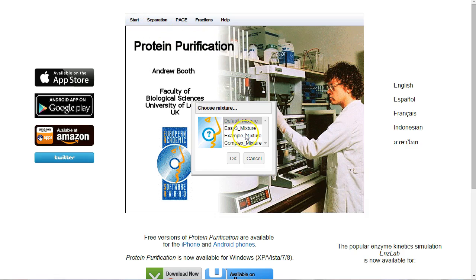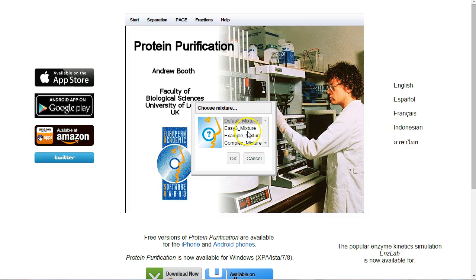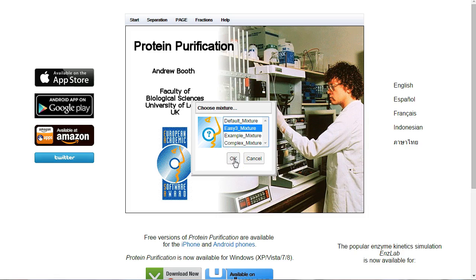In this example, we're going to use Easy Mixture 3. Each one of these mixtures is a mix of sample proteins from which you have to identify one single target. In this one, there's only three, so we'll have a look at that. Easy Mix 3, and OK.